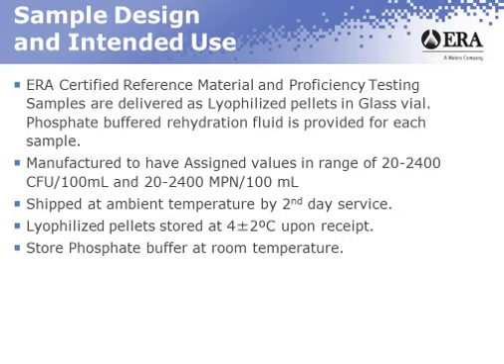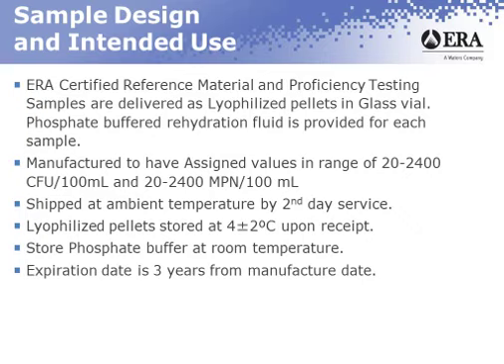The phosphate buffer that comes along with all the samples is your typical phosphate buffer with magnesium chloride. It doesn't require any refrigeration. You can just store it at room temperature. That's how the instructions read. People have put it in a fridge. It's not going to cause any problem, but really there's no reason to have it there. And when you get ready to use it, you have to warm it up to room temperature anyway. So please just leave it out at room temperature.